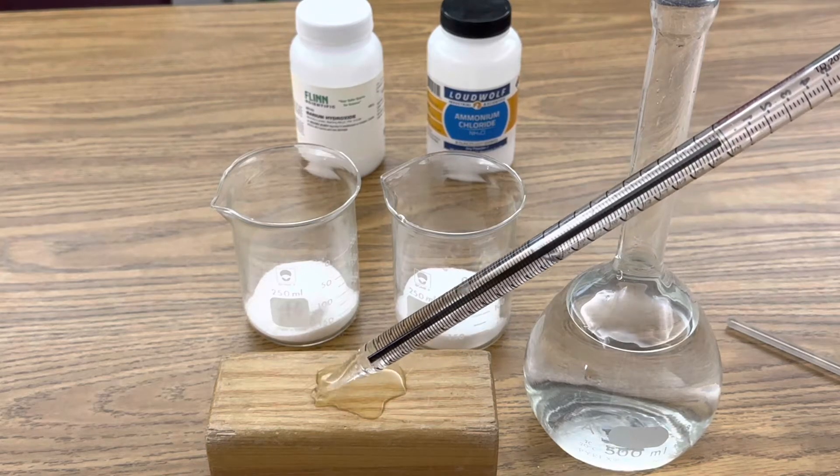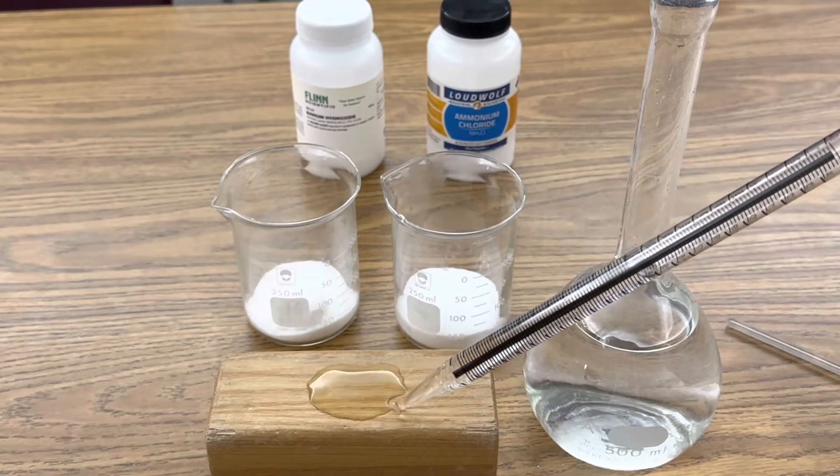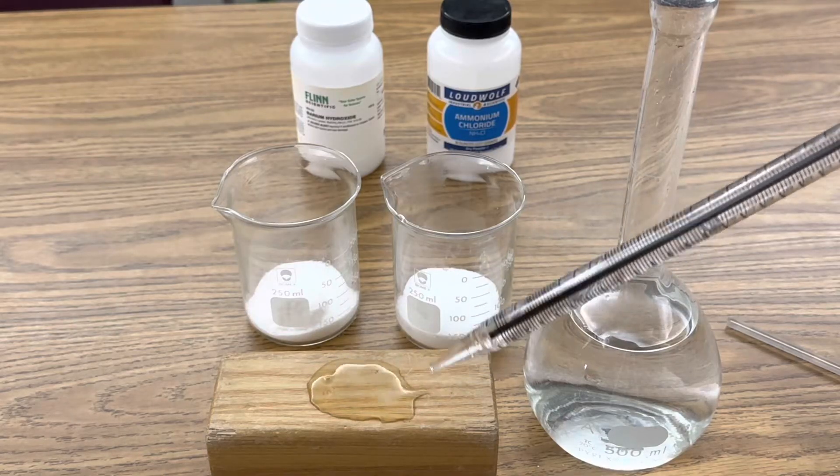I'm going to find out if during this endothermic reaction it'll absorb the heat from the water until the beaker freezes to the block of wood. Let's find out.